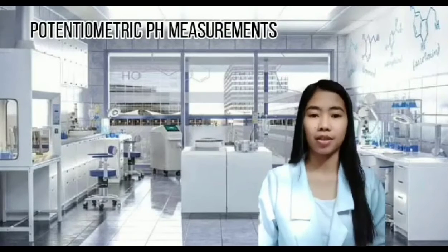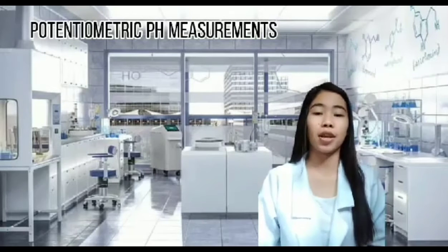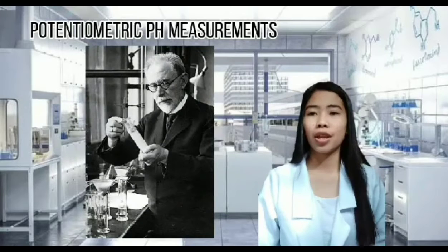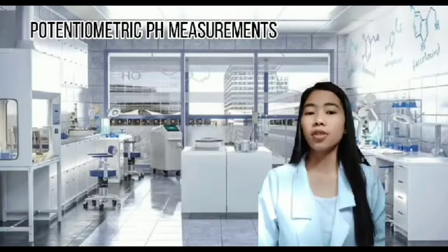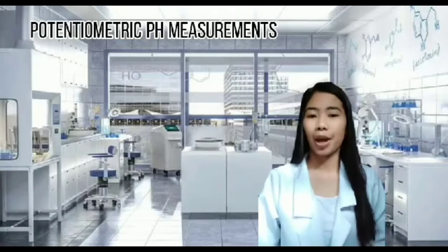So let's proceed to our next topic, which is the potentiometric pH measurements. The principle of potentiometric pH measurement can be traced back to 1909 by chemist Søren Sørensen, who introduced the so-called hydrogen ion exponent, pH, to describe the concentration of hydrogen ions in a solution. This was the basis of the development of the conventional pH scale.